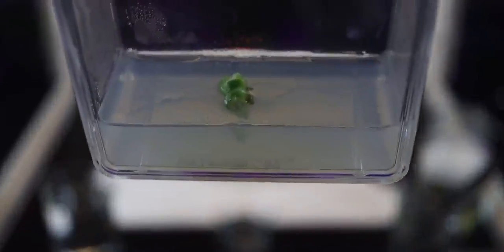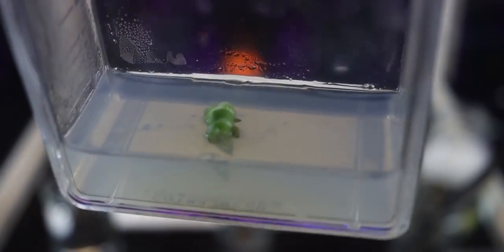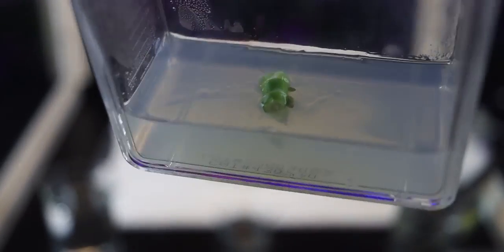So this is basically what that container looks like up close. Now I do appreciate it's not the easiest thing to be able to see in there just due to the way that it is, but the node is sat there in agar, hopefully in a 100% sterile environment so that it can start to basically propagate itself and create new shoots.